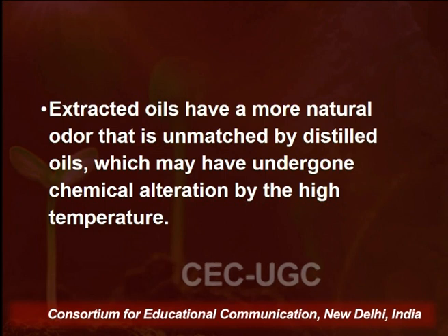This is the same what I have told you, that the extracted oils have a more natural odor, and that cannot be compared with the oil that is obtained by the distillation technique. And therefore this method is largely preferred in the perfumery industry and is considered to be a high cost method because organic solvents are involved in it.